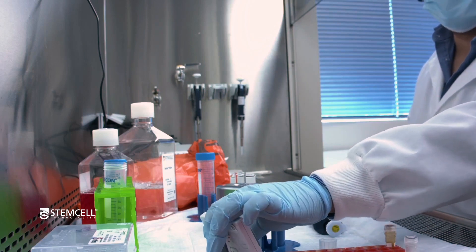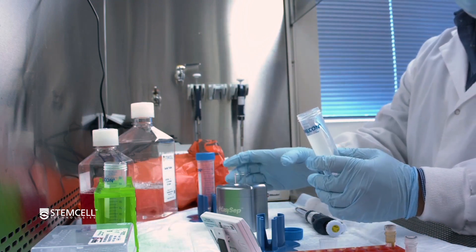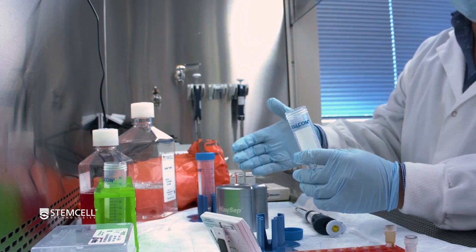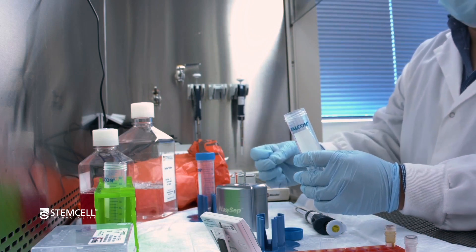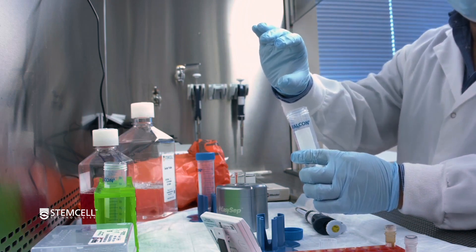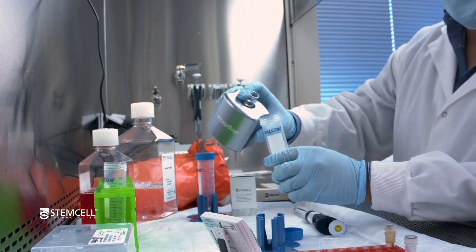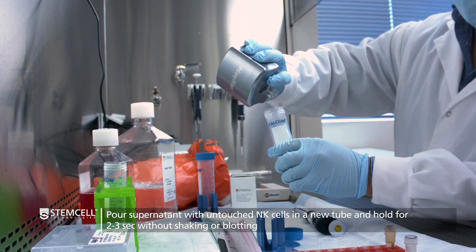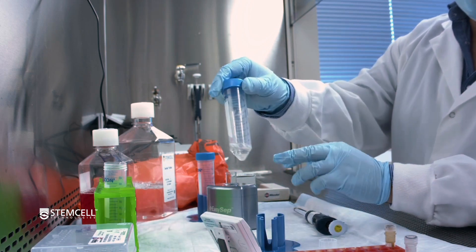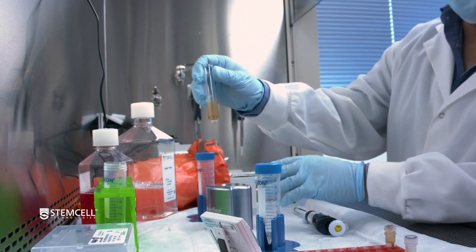After the 3-minute magnetic separation time has elapsed, take a receiving tube and then pick up the magnet and in one smooth motion invert the tube to pour out your desired cells. This being negative selection, your labeled unwanted cells remain in the tube. When you do this pour, hold it for 2-3 seconds, but make sure not to blot or shake the tube. Now you have your negatively isolated NK cells, and here you have your unwanted cells.